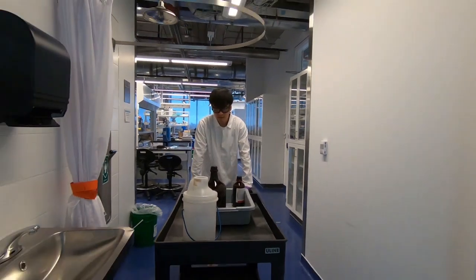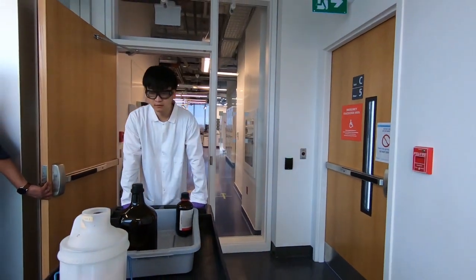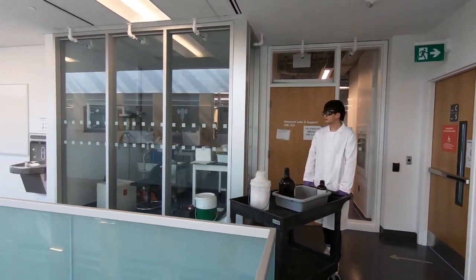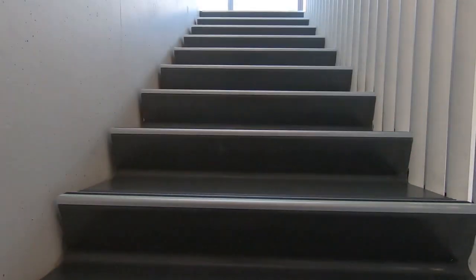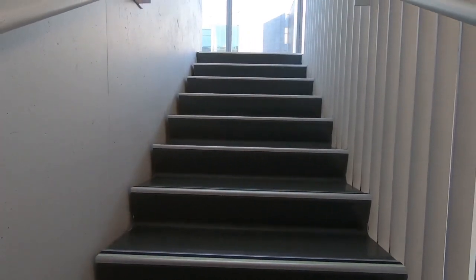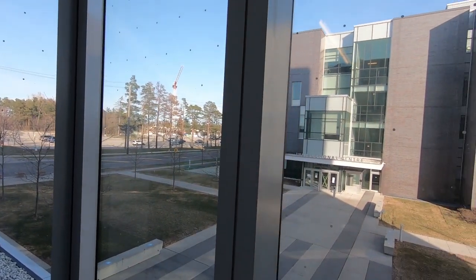Depending on your work area, you should avoid transporting hazardous materials through any public spaces. Within the EV building, never transport any hazardous materials through any areas outside of the laboratory spaces, such as the atrium and public hallways. Regardless of the building you're working within, you should never use stairs during transport due to the risk of tripping. And hazardous materials must never be transported outdoors between buildings unless you consult with a member of ChemStores or EHS.